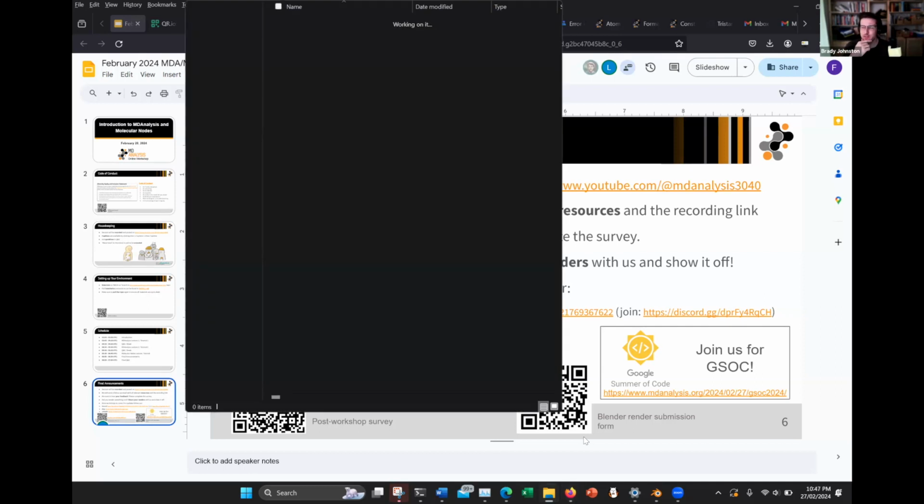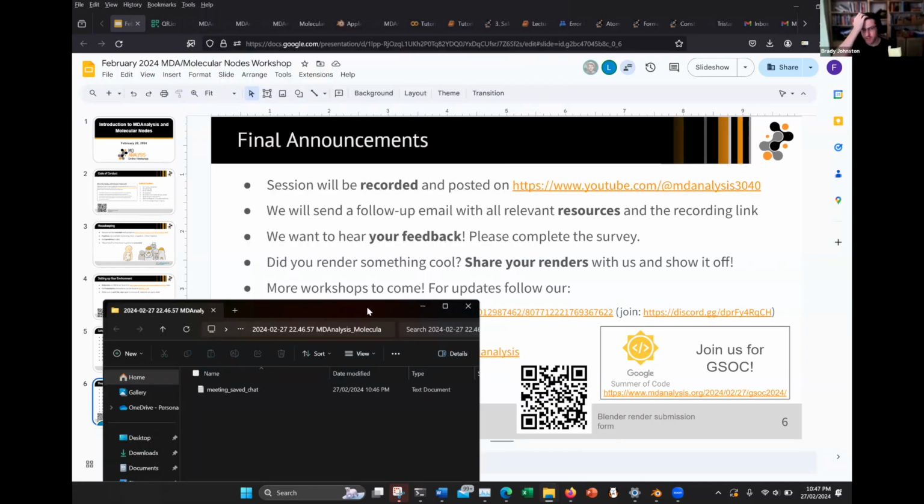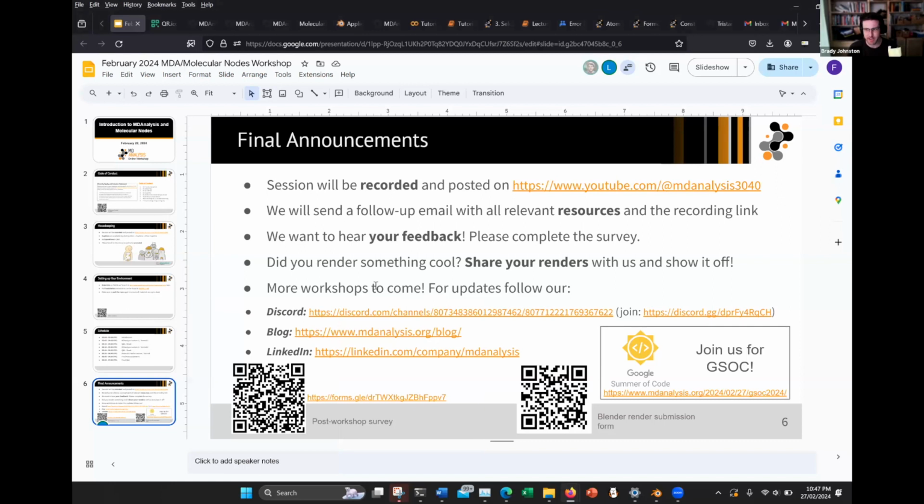Inside of Blender, if you keep everything as point clouds, like the spheres in Cycles, I've had 500 million atoms on screen, and it renders them all, because rendering as point clouds is extremely memory and computationally efficient. So large scenes can get pretty large before it starts getting problematic. But once you start doing things that aren't just the perfect spheres, it crashes a lot earlier because you have to deal with all sorts of complex geometry.